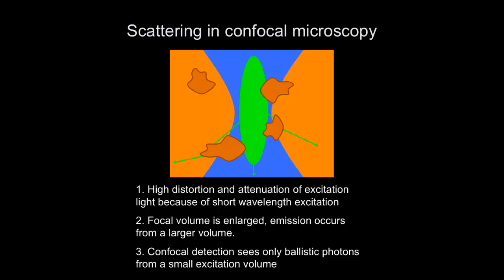Okay? So confocal microscopy, therefore, is really, really sensitive to scattering. Scattering tissues really reduce the signal tremendously. And so, therefore, actually, confocal microscopy is not used a lot for deep tissue imaging. So this will indicate these photons, the non-ballistic photons, the photons that have scattered, will not be detected. And that's a loss of information right there.